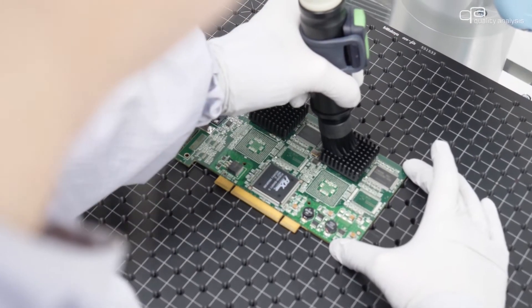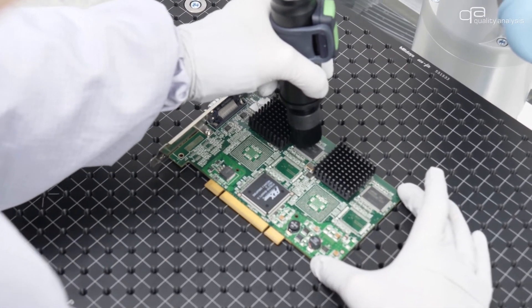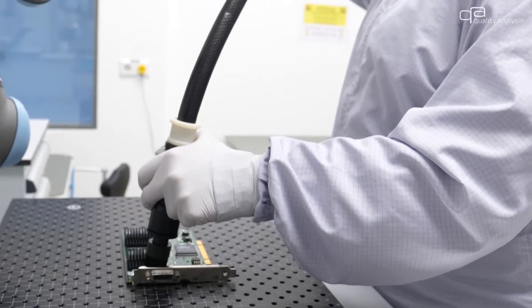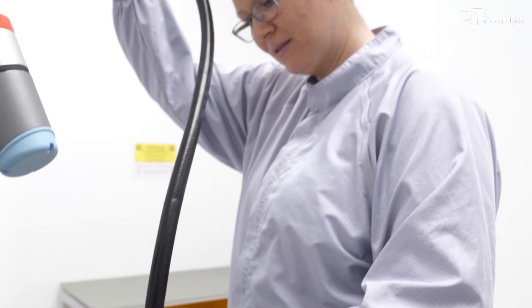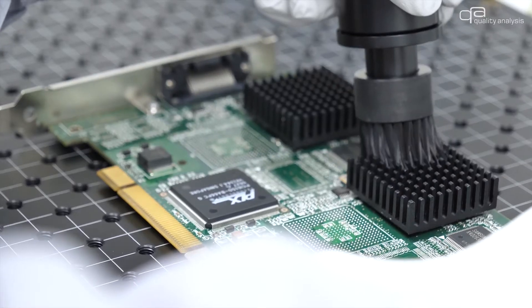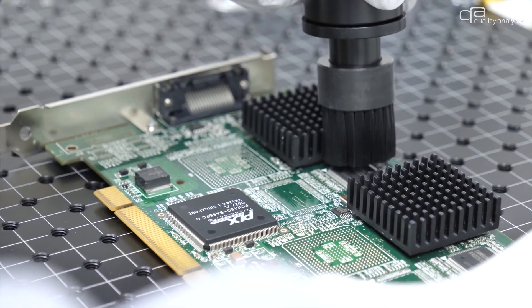For non-wet extractable components such as micro and process electronics we use suction extraction. Dry adherent particles are extracted from the component surface using a particle suction extraction system.